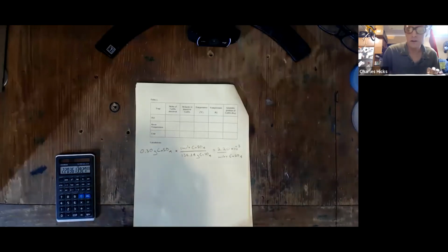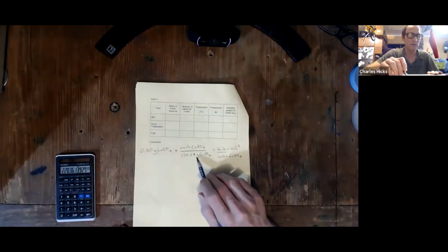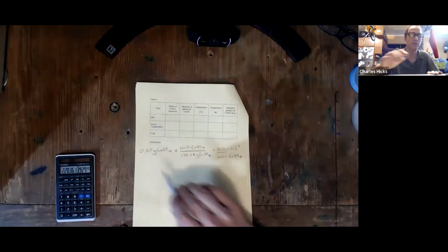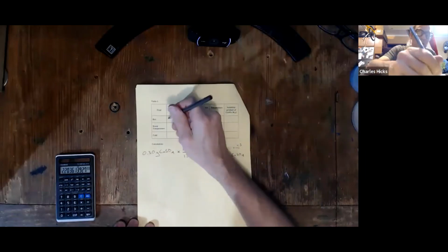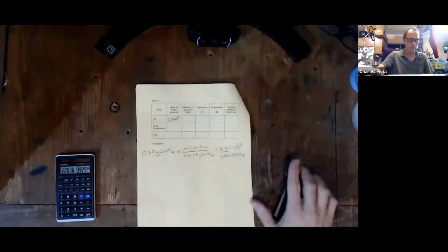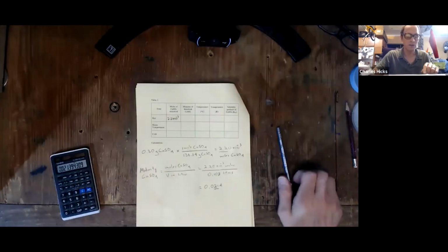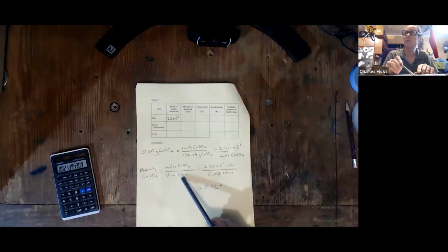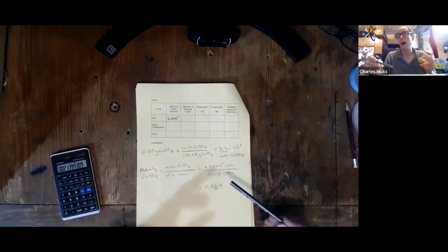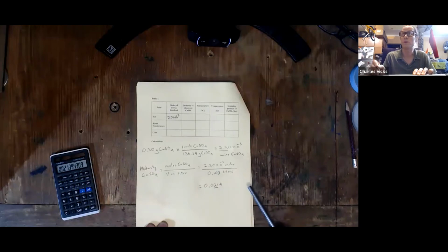So next we need to calculate the number of moles of the calcium sulfate. So I added up the molar mass of it for you there, and 0.30 grams dissolved in my sample trial. So that would be 2.2 times 10 to the minus 3 moles. And next we need to calculate the molarity of the calcium sulfate. Now remember, we prepared 100 milliliters of solution, but then we used 3 milliliters, 1 dropper full approximately. We estimate that to be 3 milliliters to wash the container. So the total volume was 103 milliliters, or 0.103 liters. So that would be the molarity.